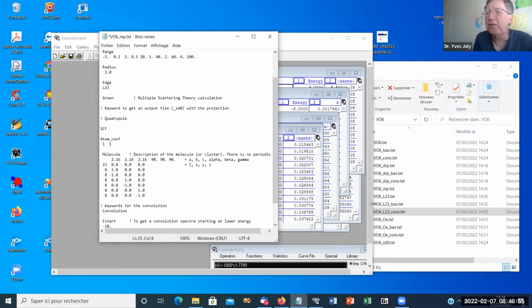And I am going to define some number of orbitals, for example, 2. The first one could be the 4s. So it's N and L, you know. By default, it would be 2 electrons. And the 3d, the second one, is 3 electrons, I think. Yes, for vanadium, it's 3 electrons. So that's the default. In fact, it's what is done automatically in the code.